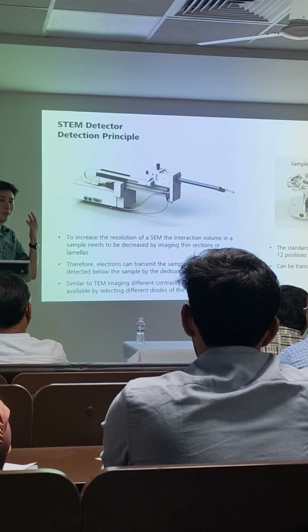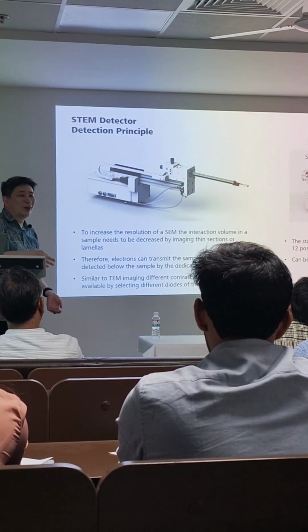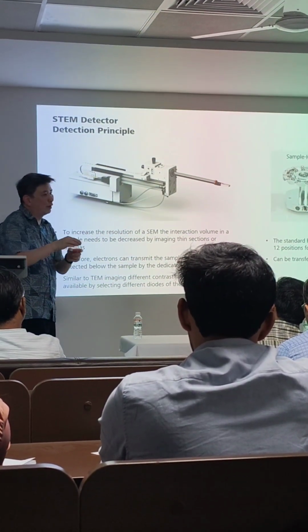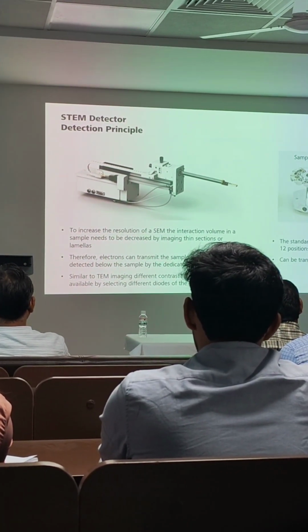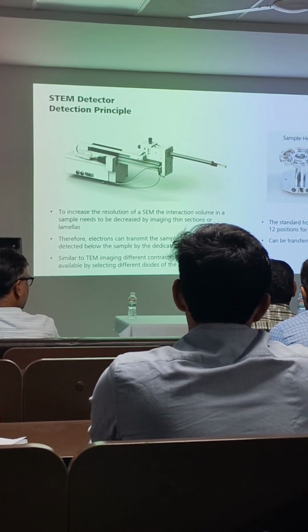Without taking it off. I am always very scared of handling the TEM grid. Yes, one mistake. My professor used to say that your hand is too big to do all these small things. You will lose it. When you lose it, we spend a lot of time just to cut the thing down again, right?